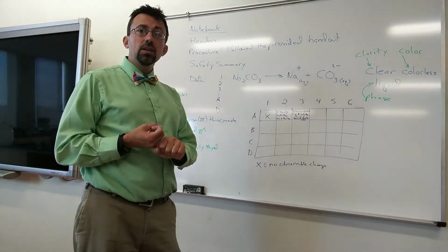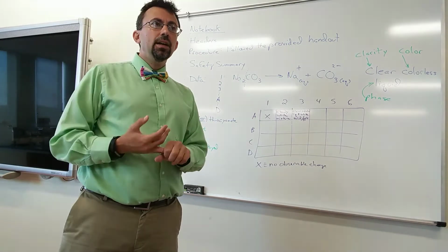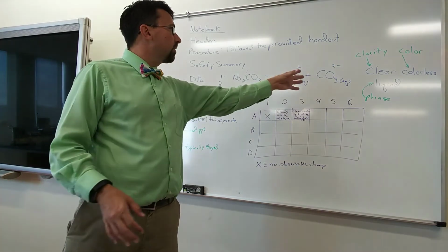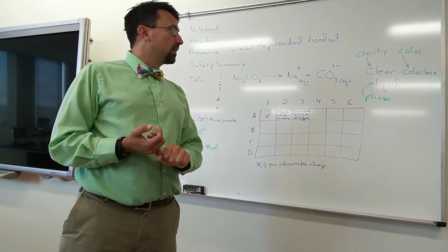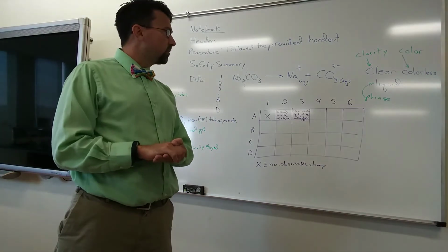The color, and colorless is a color, right? Kool-Aid is clear, but it can also be colored, or Gatorade. You can have red Gatorade. That's a clear solution, but it's red colored. And water is clear and colorless, so sodium carbonate in this case would be clear and colorless. And then write down the phase of matter. It's a liquid, it's a solid, it's a gas, I don't know, it's a plasma, whatever else you might have in there.